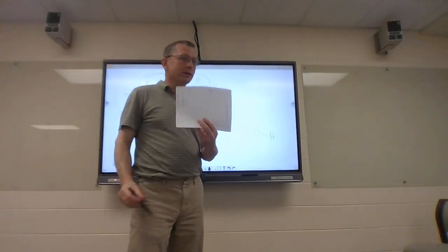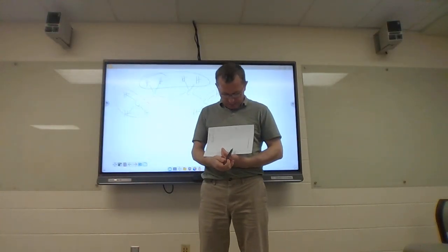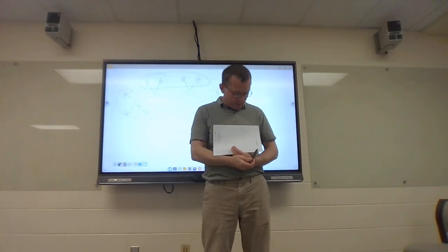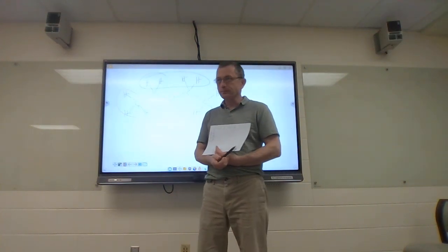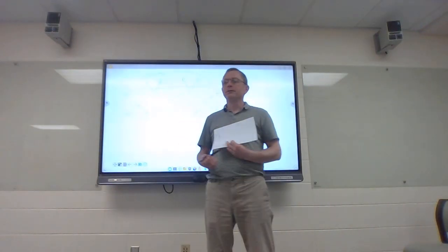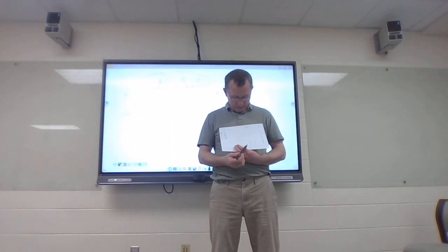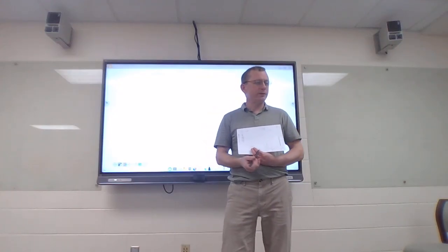And you can probably see that they're in similar kinds of ranges, right? I got something down here at about 3.5 again. I got something up here closer to 1. But I got a new additional peak. Now, we've already kind of done some chemical shift. I'm going to say jump right ahead. Look at the integrations underneath those. We got a peak at about 3.5, integrating to, what do you think that tells me?